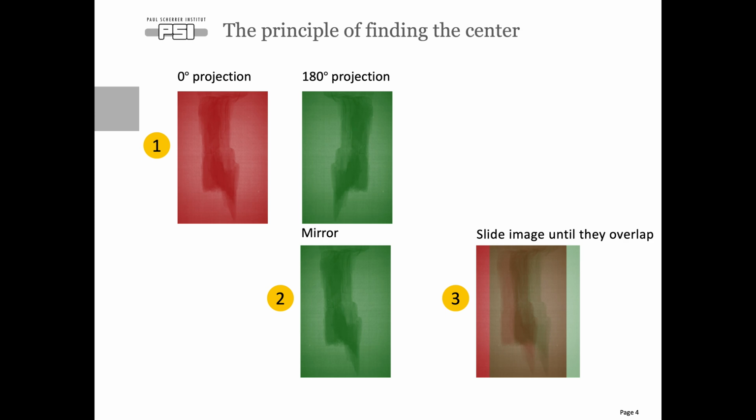There are algorithms doing this based on, for example, correlation, center of gravity, and things like that. But right now we just look at the visual version of it.